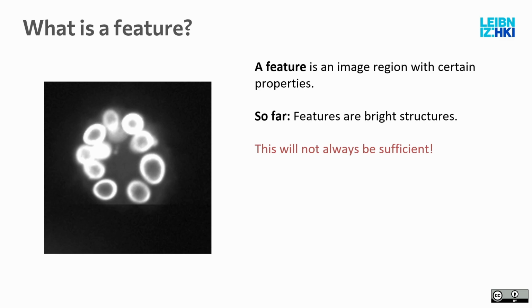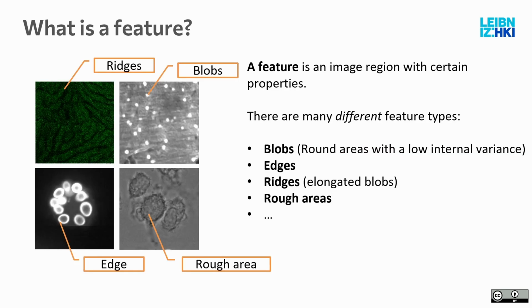There are different features available. And so far, for our thresholding, we used a simple feature. Okay, it's everywhere where it's bright. This will not always be sufficient. You will easily break that. There are different data sets that just don't have this. So we need something that reacts well to different kinds of things that you are interested in.